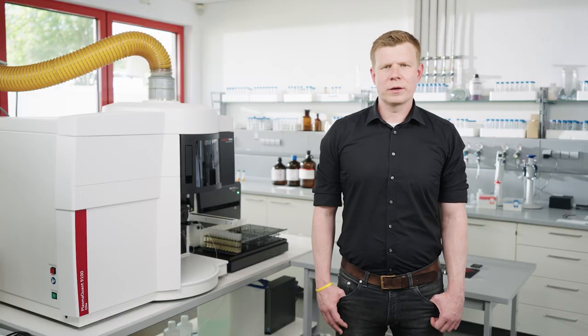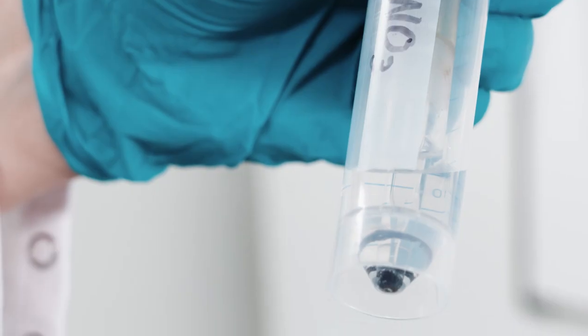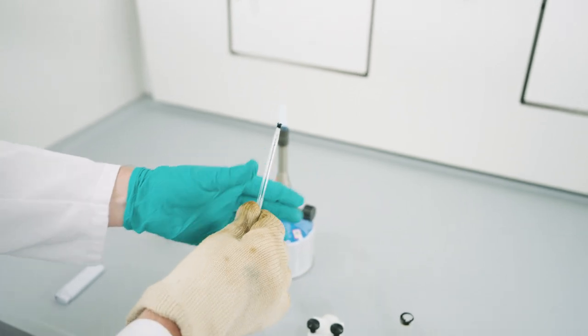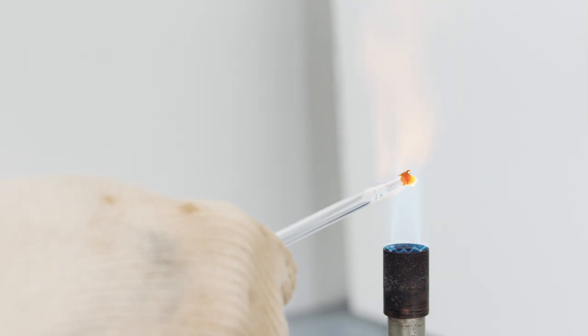A generally common approach is to clean in diluted or concentrated acids. In our experience, it is very difficult or impossible to remove the carbon deposits from the glass parts in this way. A far more efficient way to remove the carbon deposits is to burn them out in a muffled furnace or by using a Bunsen burner. To do this, simply hold the component briefly into the flame.